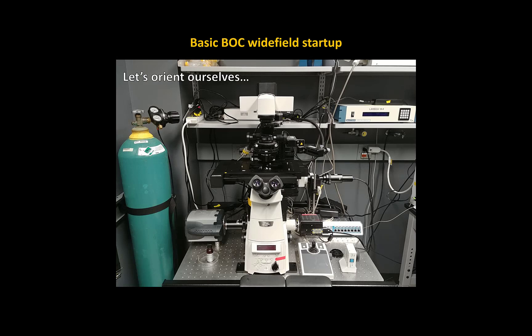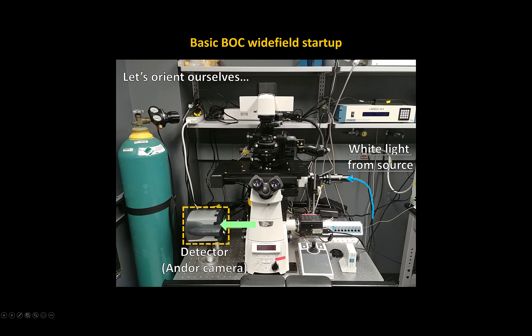Let's identify the specific components. The white light comes through a liquid light guide from the right side and into the left. There's a set of filters right here that are going to take this white light and filter it to the wavelengths you actually want to excite your sample. So light goes in here, goes up through the microscope, and then up the objective lens and ultimately excites your sample with filtered light. That light is then collected by the objective again and goes to this detector right here, which is an Andor camera. If you have dim samples or fluorescence that isn't emitting a ton of light, you can bump up the signal with some mechanics present in the Andor camera.